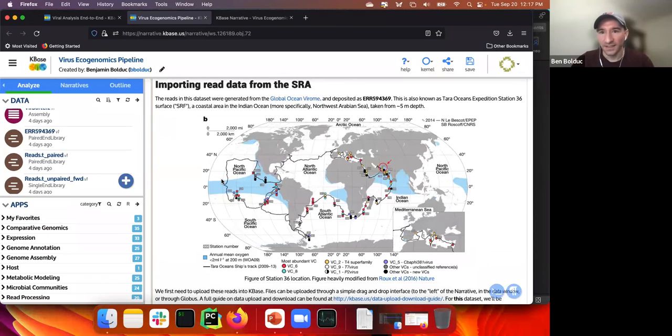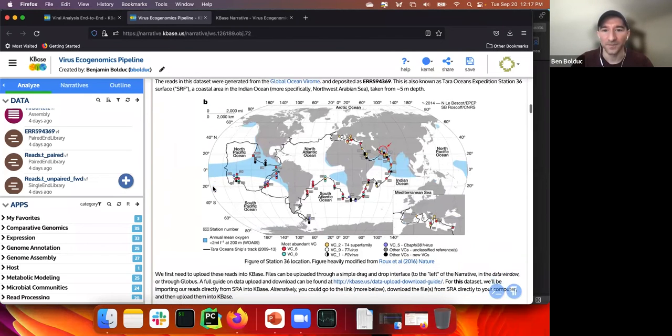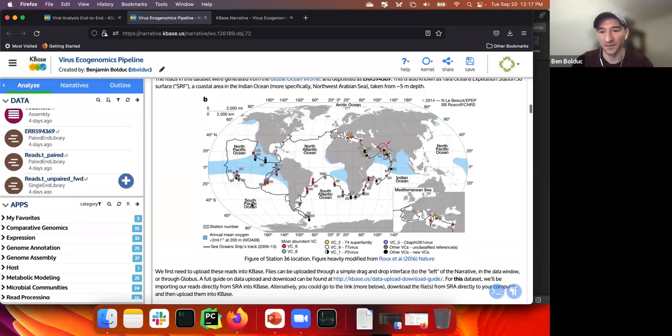So we'll import the read data. This is the exact same thing. So now, after looking through the old school Cyverse, you get to see the different way of looking at stuff. In here, I've uploaded images from various references, citations and whatnot, so that you can actually click.